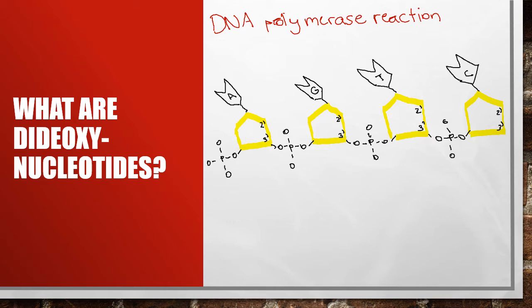You can see that the dideoxynucleotide is added to the nucleotide chain, but because there are no hydroxyl groups present on either the 3' or the 2' end, no further dNTPs can be added to the nucleotide chain. This stops DNA polymerase reactions and results in chain termination. Dideoxynucleotides are also known as ddNTPs.